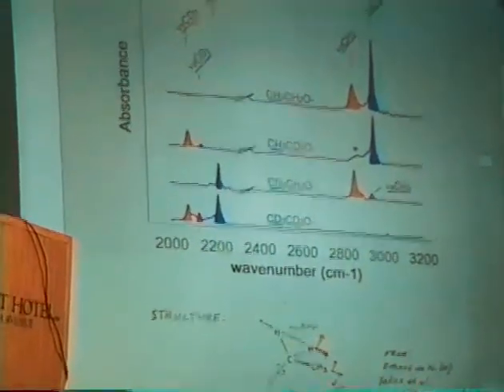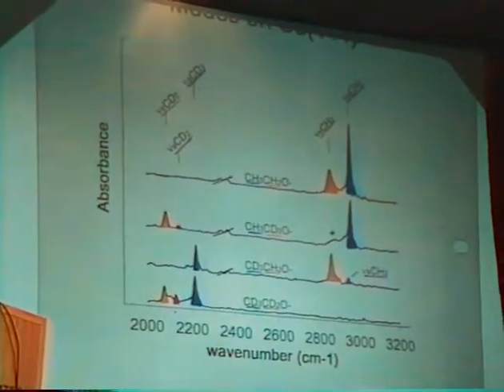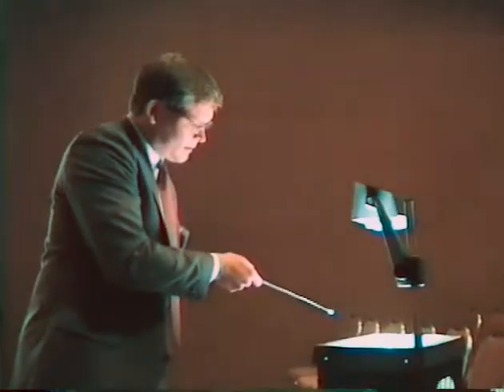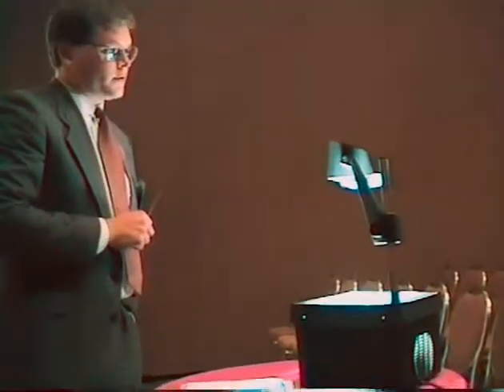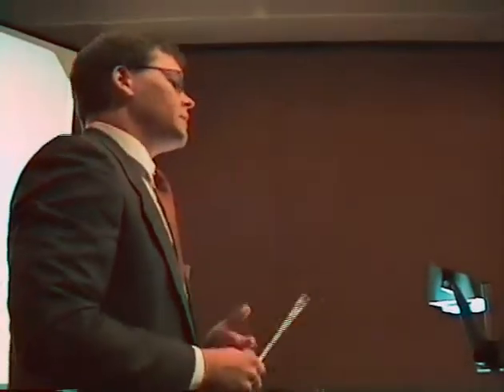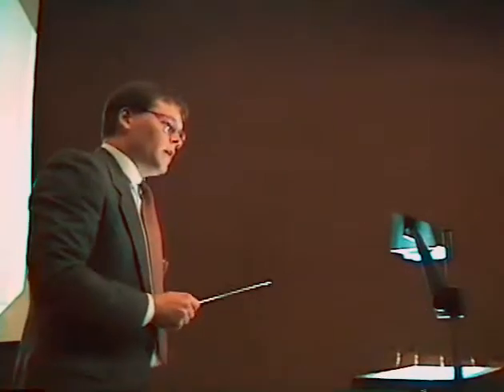And that's what I try to indicate here, the structure of ethoxide. The interesting thing is I didn't have to make that myself. That's from Yates's group. That's their structure for ethoxy on the nickel 111 surface. What's interesting about that is that we agree in general about the structure of ethoxide on these two surfaces. It's the same face, the 111 face, but ethoxide is formed in very different ways on copper and on nickel.